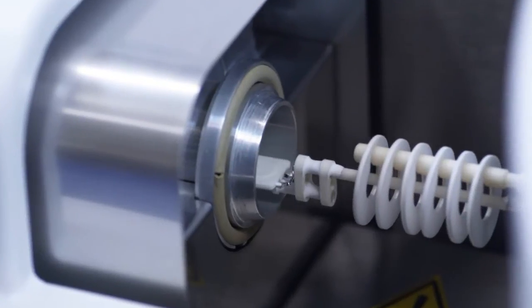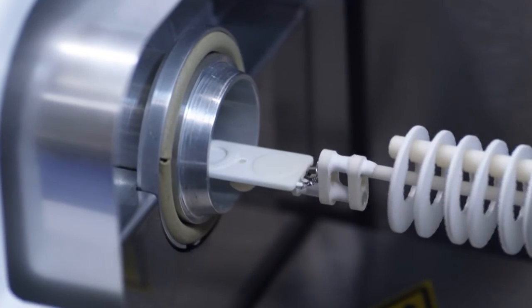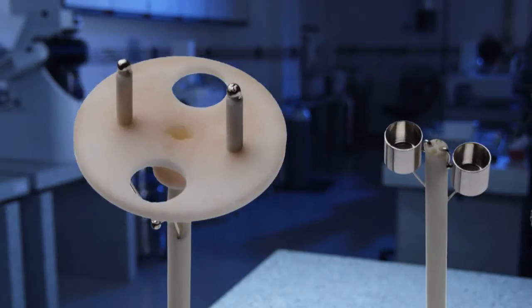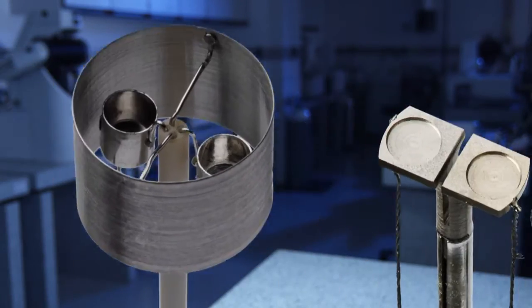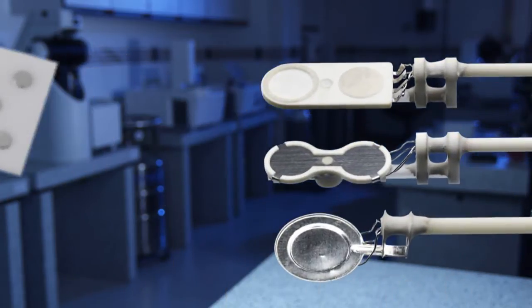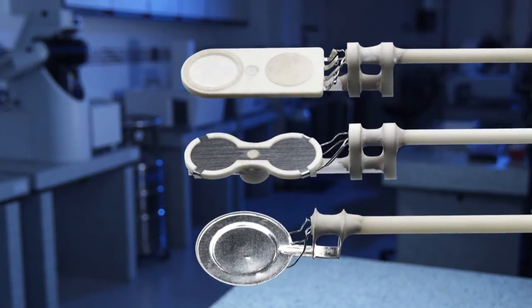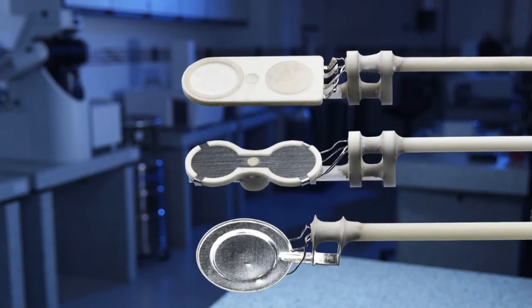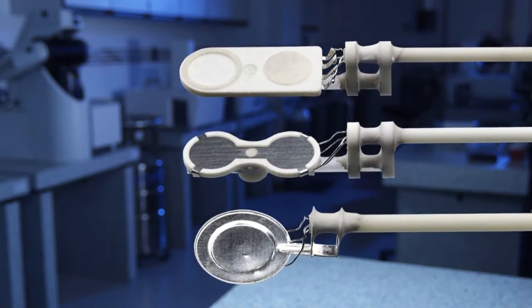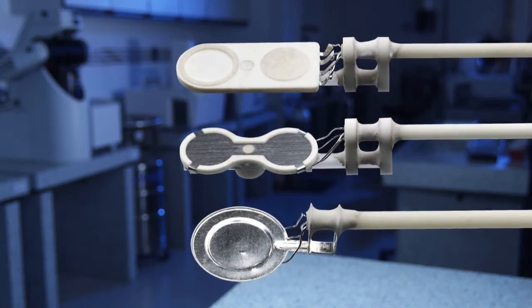The current Multistar TGA DSC sensors are the result of 50 years of company experience and innovation. The advanced multilayer thermocouple technology with six thermocouples amplifies the measurement signal and thereby increases DSC sensitivity.